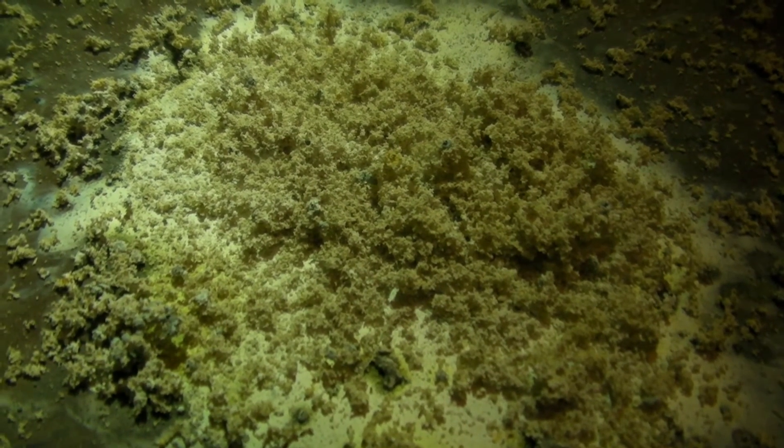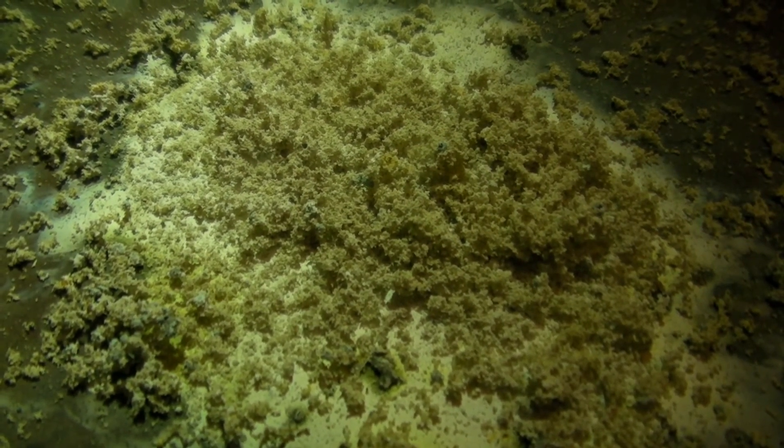The zinc sulfide can be used for the preparation of hydrogen sulfide. This was the reaction of zinc and sulfur. I hope you enjoyed. Please rate and comment.